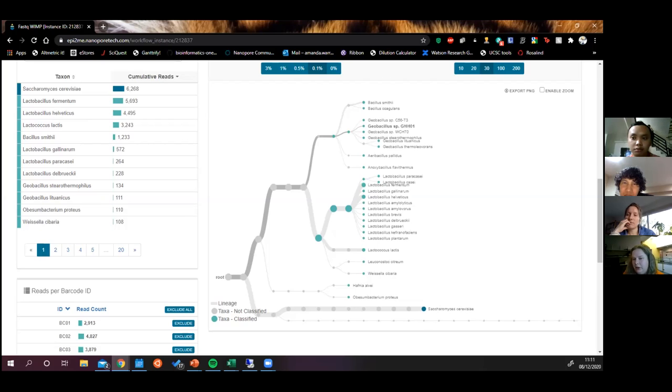If you have the data, go for the whole genome. If not, is it also possible to combine whole genome sequences for those that we have the whole genome, and just barcode sequences for species that we only have barcodes for now? On one flow cell? I mean, in the database for the taxonomic profiling.